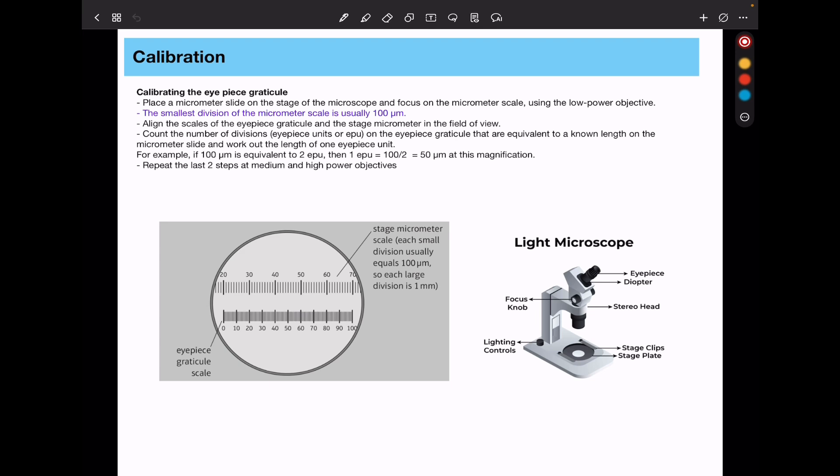In this core practical, we're going to look at calibration of a microscope. This is to find out how many eyepiece graticule units equal a length of a stage micrometer. We're going to carry out staining of cells, placing the stained sample on a microscope slide. Observation under low power to locate the cells and then observation under high power to clearly visualize the structures. Sometimes this is internal structures within a cell. And then we're going to be able to draw both at low power and at high power.